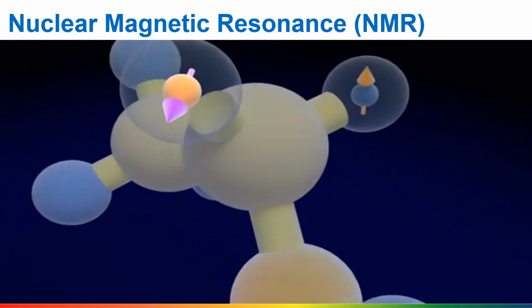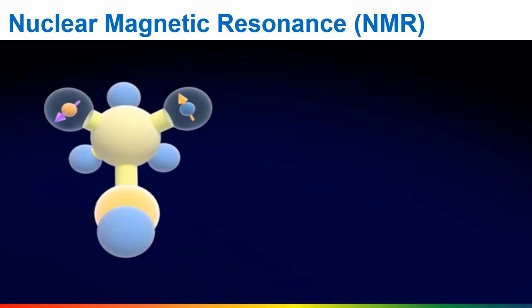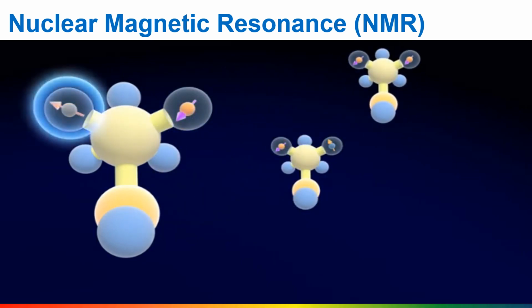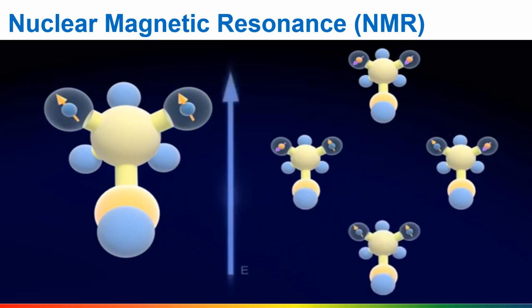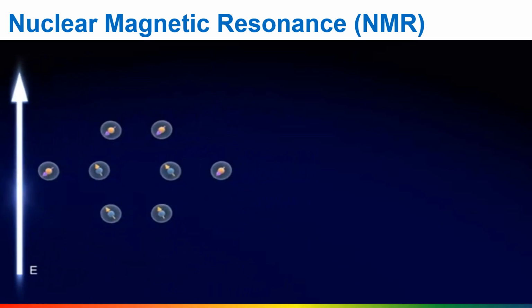As an example, we look at the 2 methylene hydrogen spins, which are chemically identical. They can have 4 combinations: 1 spin down, 1 up, both spins down, 1 up, 1 down, 2 spins up. Each combination has a different energy level and influence on the neighboring spins, except that up-down and down-up combinations have the same energy level and influence.